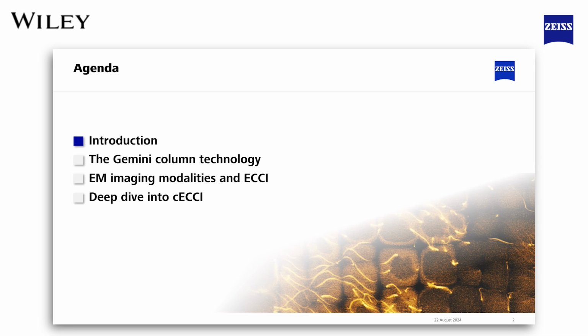So before I jump in, this is our brief agenda. I will be covering the base SEM microscope configurations that enable the cutting-edge ECCI technique, and then go through some basic SEM fundamentals necessary for ECCI. After my short intro section, Stefan will give us a deep dive into the topic.